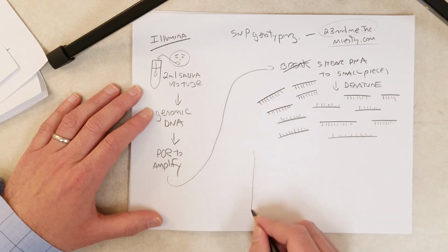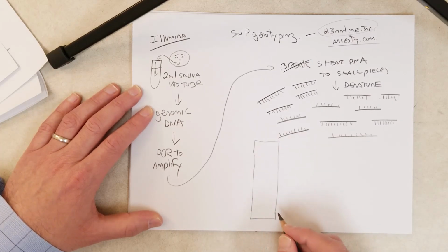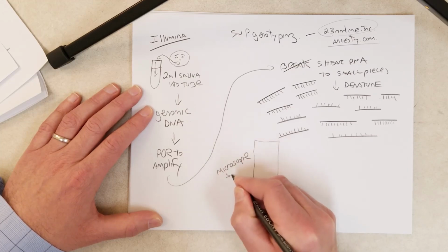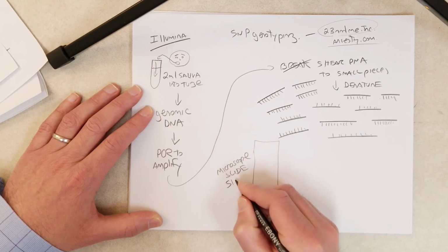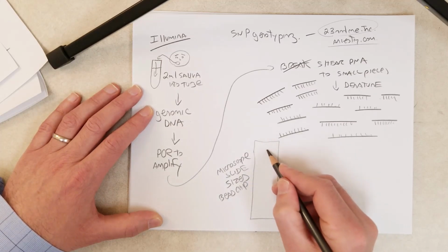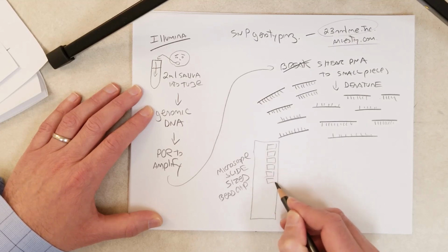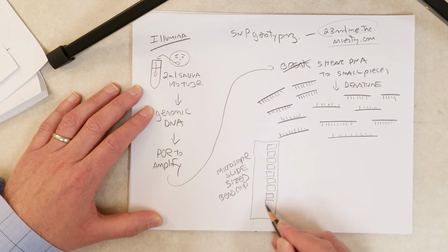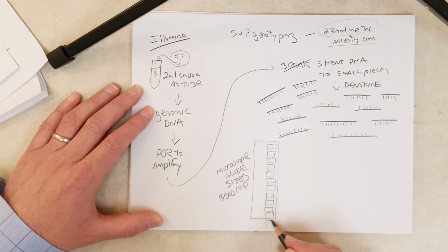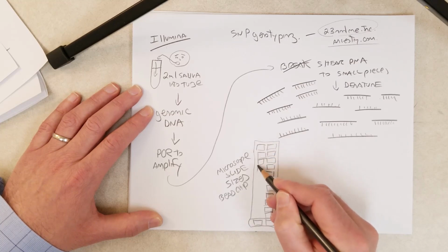The next step is to take all those pieces of DNA and put them on this microscope slide-shaped or sized bead chip. Okay, so it looks like a microscope slide. And on this slide are going to be 24 chambers. I tried to put 12 here. 1, 2, 3, 4, 5, 6, 7, 8, 9, 10, 11. I'll put another one down here. Make the slide a little longer. And I'll put the others in here.